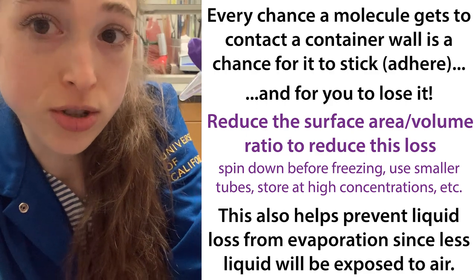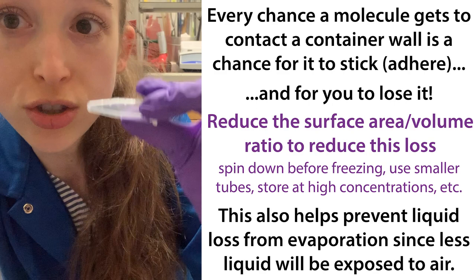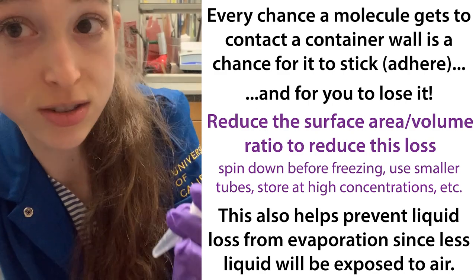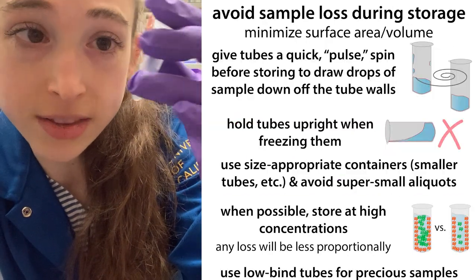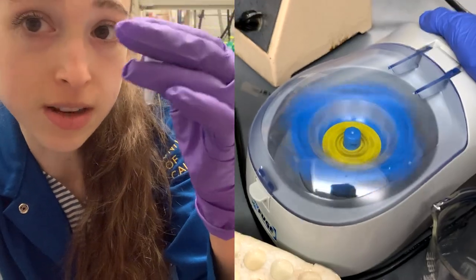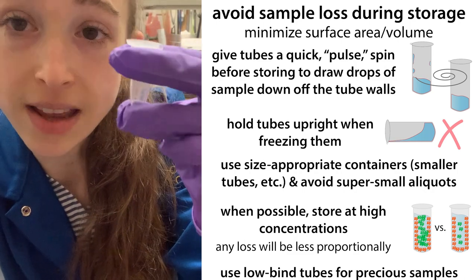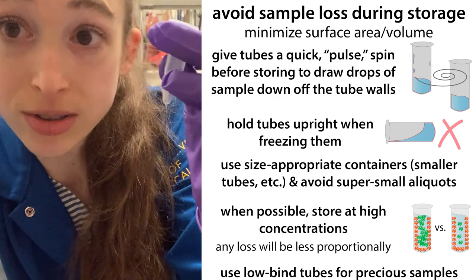Basically, the more surface area you have in contact with the walls of the tube, the more opportunities there are for those molecules to stick to the sides. Sometimes there are little drops on the side of the tube, and when you go to freeze them, you now have an increased surface area. Whereas if you do a quick spin down, you reduce that surface area, and therefore have fewer molecules able to stick to the wall.